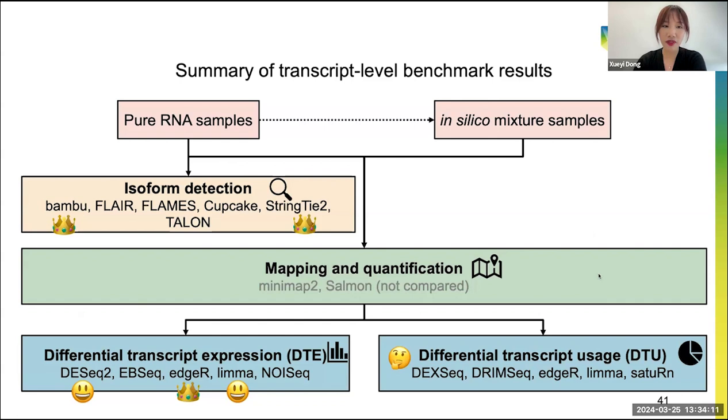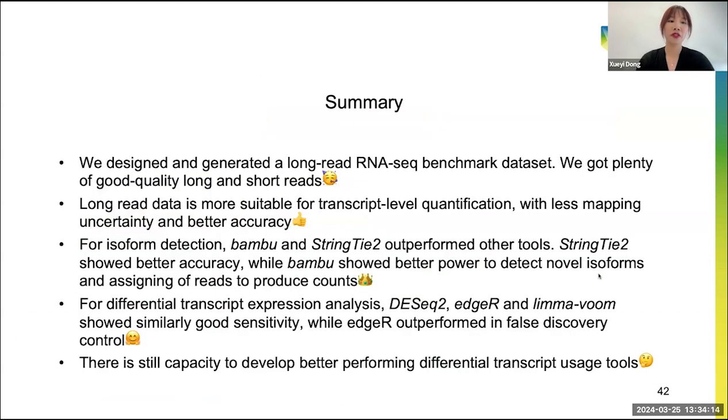DTU tools. So overall, in summary, we designed and generated a benchmarking dataset with plenty of good quality long and short reads. And for transcript level quantification, we found out that long read data is more suitable for this task with less mapping uncertainty and better accuracy.